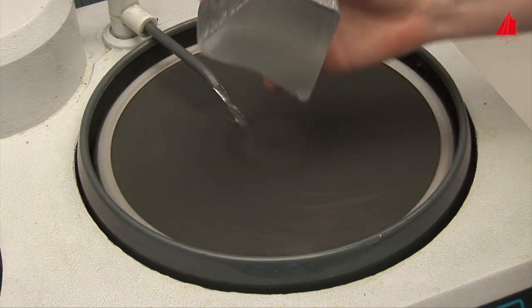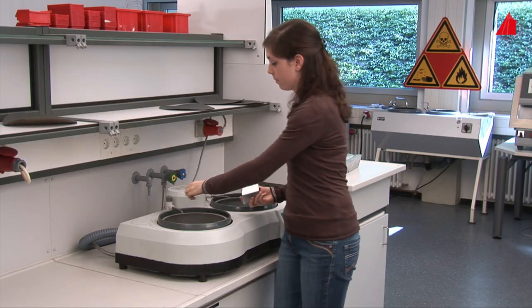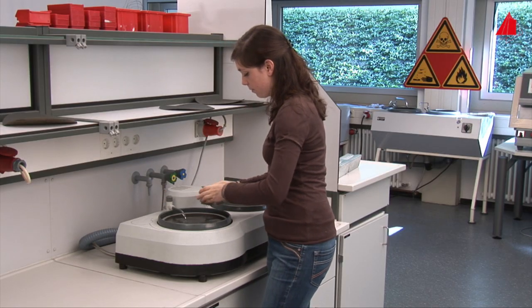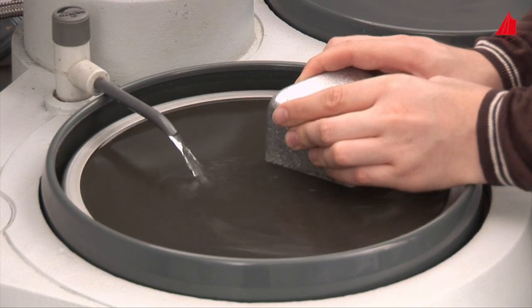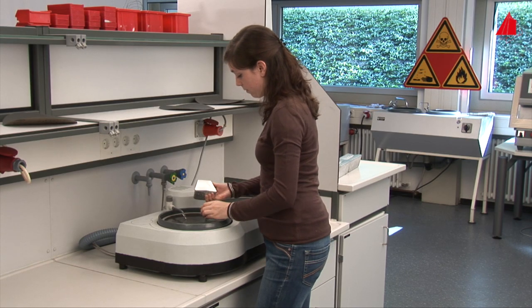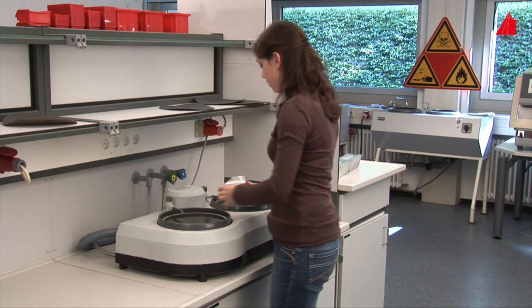the material tester rotates the sample by 90 degrees and grinds it once more. This time with medium grained silicon carbide paper. Here again, she uses sufficient flushing with water. This keeps the sample cool and prevents the abrasive paper from being loaded with material particles.